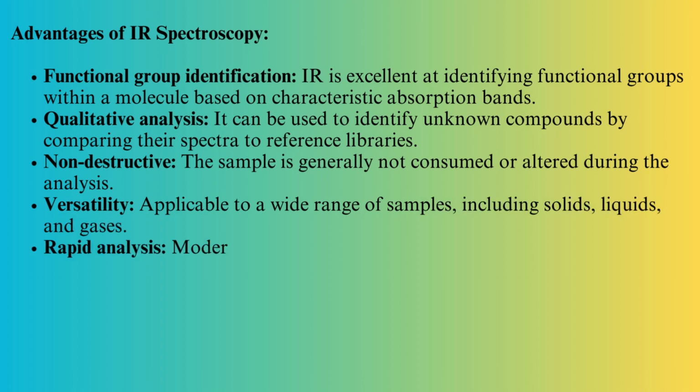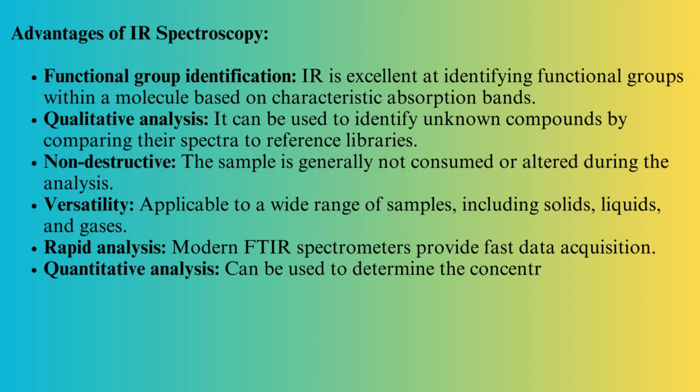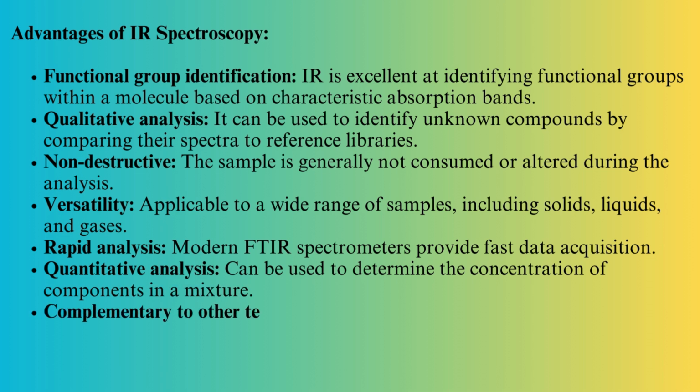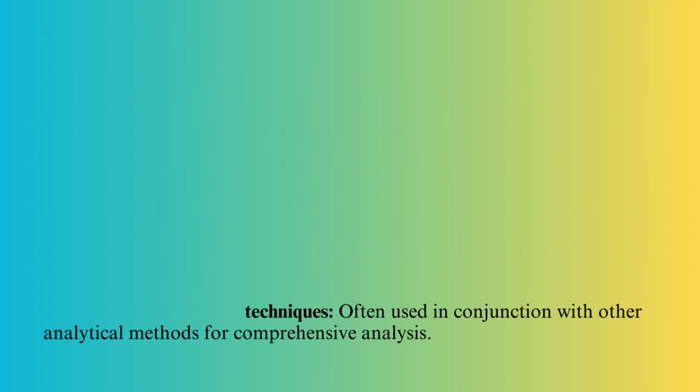Rapid analysis: modern FTIR spectrometers provide fast data acquisition. Quantitative analysis: it can be used to determine the concentration of components in a mixture, complementary to other techniques, often used in conjunction with other analytical methods for comprehensive analysis.